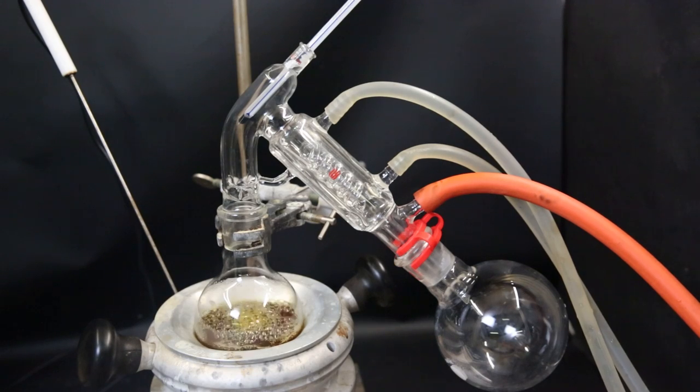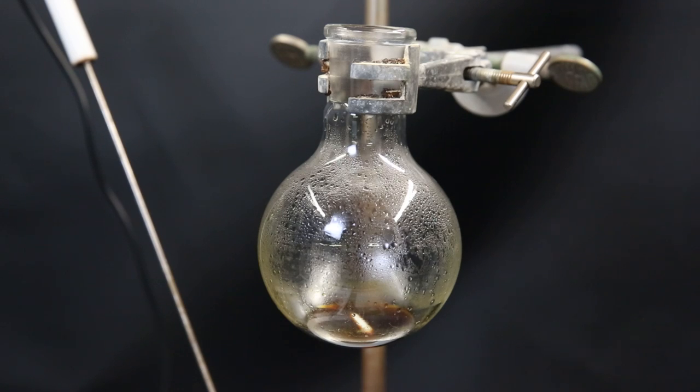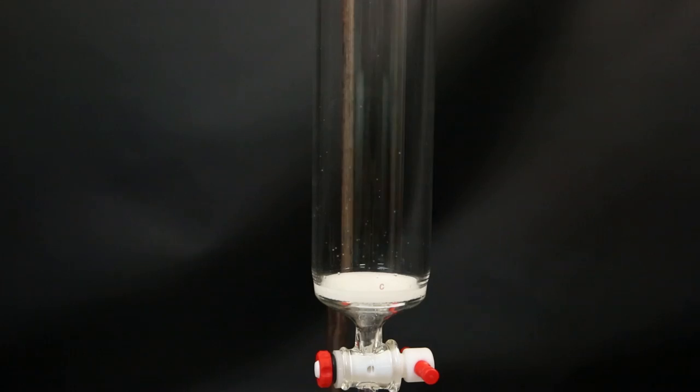Now I set the filtrate up for a short path vacuum distillation to remove all of the DCM. After no more DCM seems to come over, I stop the distillation and I am left with a brown-red liquid that contains some solid.